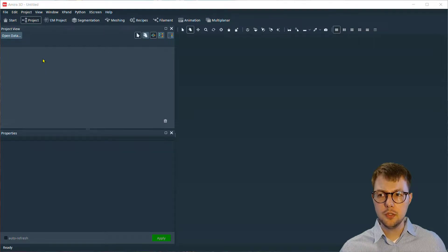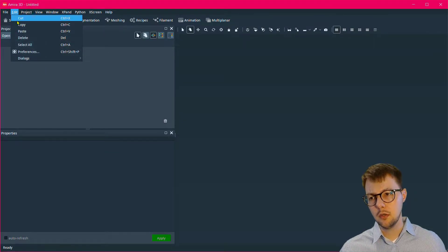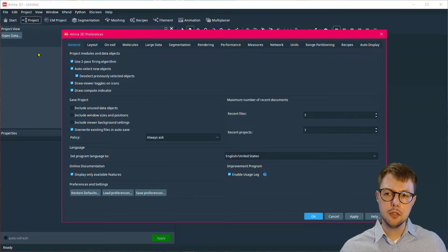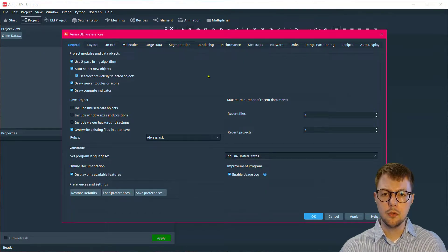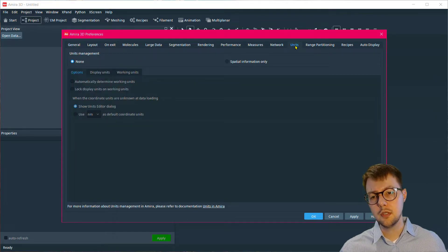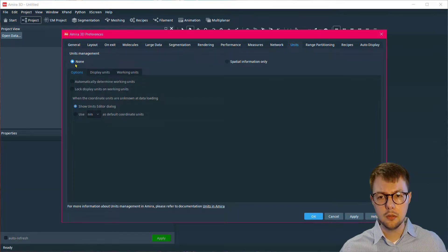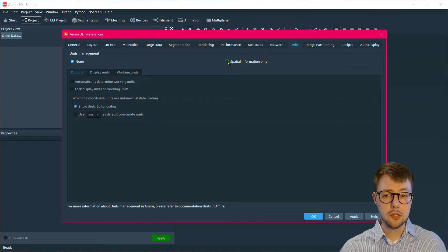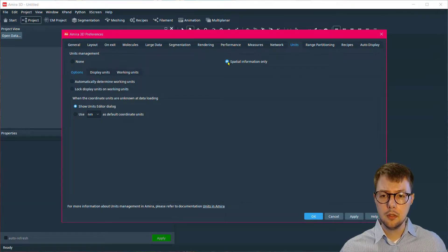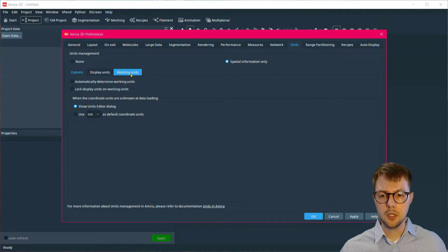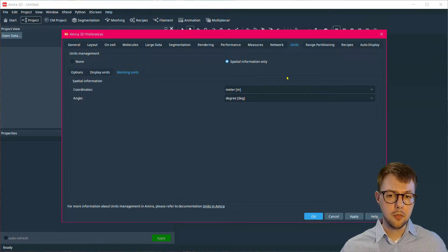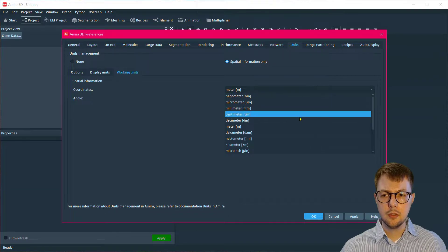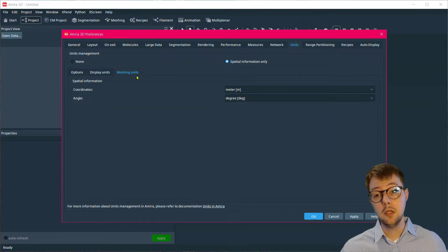If you want to measure the surface area of a data set starting from label data, you need to first adjust Amira or Aviso such that the units are set to spatial information only. Then you can adjust the working units and the display units respectively. In this example, I'm going to set the working units to meters and the display units to centimeters.